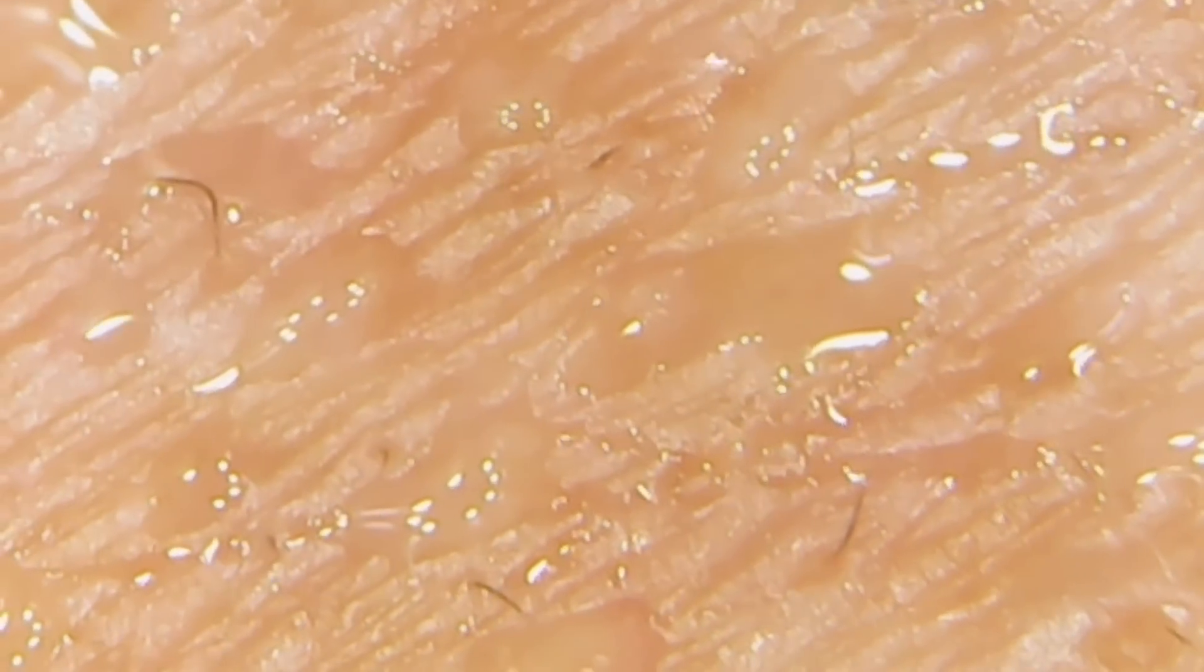I also wanted to observe the hair on my head and on my chest. Here too we can see that the hair has different thickness and also grows at a different angle from beneath the skin.